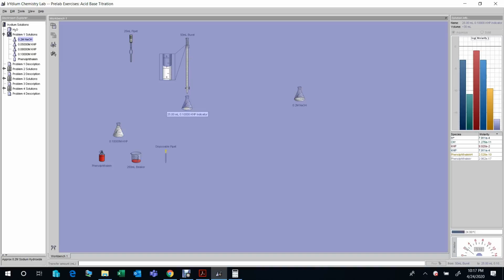Okay, how much should we add? You see here, just now we calculated the rough amount of sodium hydroxide to finish the titration is 12.5 milliliter. So it's kind of safe that we can add 12 milliliter solution first, or maybe 12.1. Let's see, 12.1. Here we need to add very accurately because the burette is a very accurate instrument, so we can control the amount very well. So we first add 12.10 milliliter, then we pour.